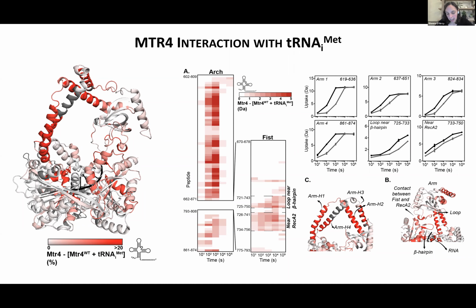I'm taking a little bit of liberty on this question, so I apologize. Okay, so I will say that we have to remember that we're in HDX, where we're still measuring averages. If we have proteins that are visiting multiple conformations, but they're not interchanging, so we have conformation 1 and conformation 2, we would be able to detect two separate exchange profiles. But if those conformations are interchanging, then in the HDX experiment we're going to be measuring an average deuterium uptake. So we wouldn't be able to detect those transient intermediates. I want to mention two things. If your protein is unfolding and you get aggregates, it's very easy to see that in your spectra, and so you straight away know you need to go back and alter your conditions.